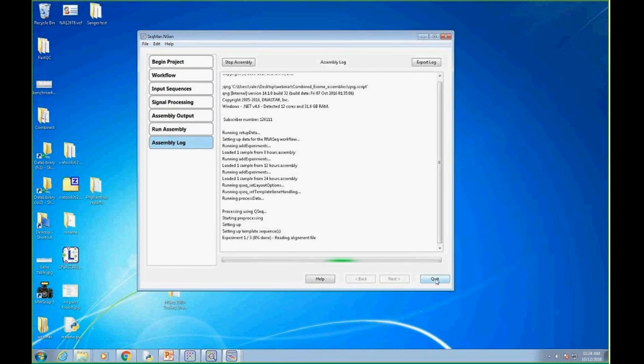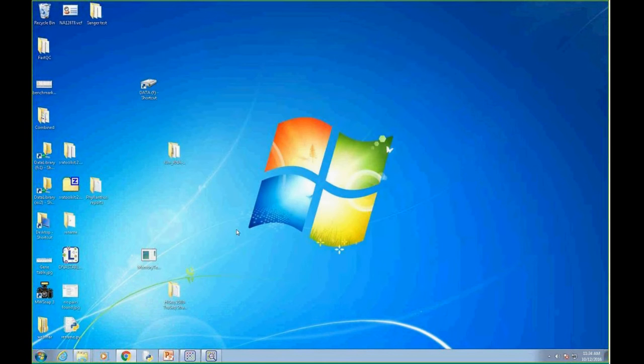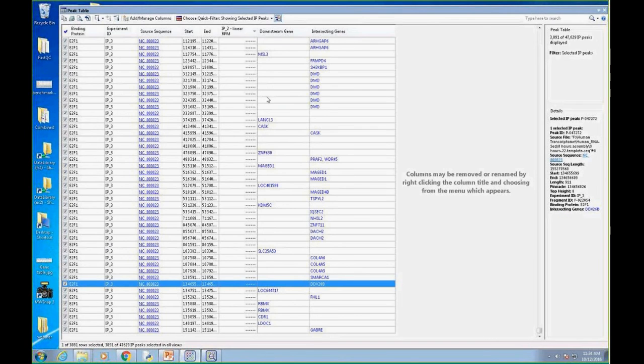I don't know how much bandwidth this will take with our webinar, so I'm just going to quit this. And when it's done, I'll have the option here just to open it right in ArrayStar. And that's typically the next place that we want to go, our ArrayStar software.